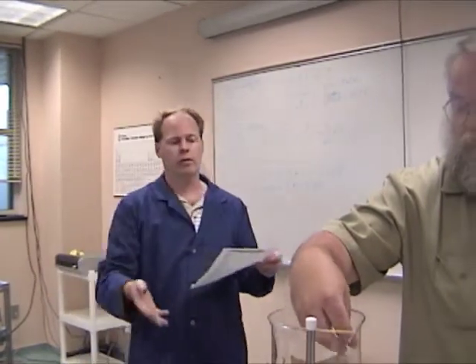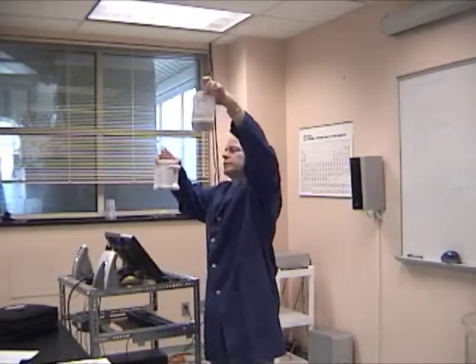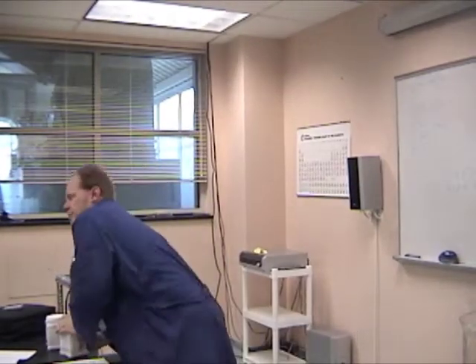So I've got my oil. I've got some catalyst here. This is what the difference between potassium hydroxide and sodium hydroxide look like. I'm going to pass this around so you can see it. Just don't open it.